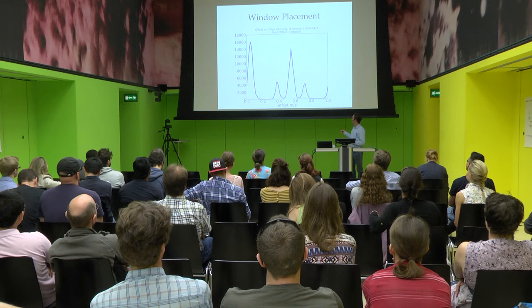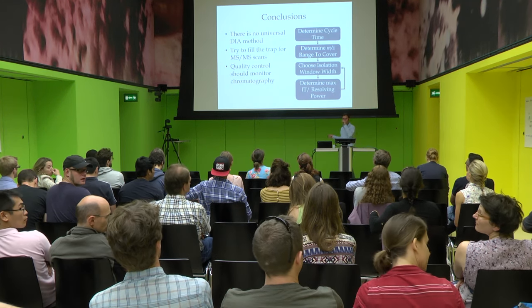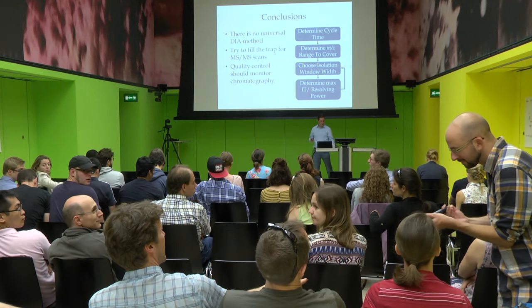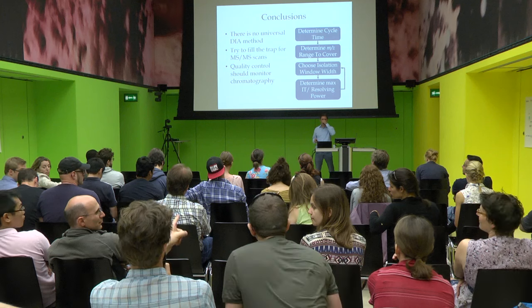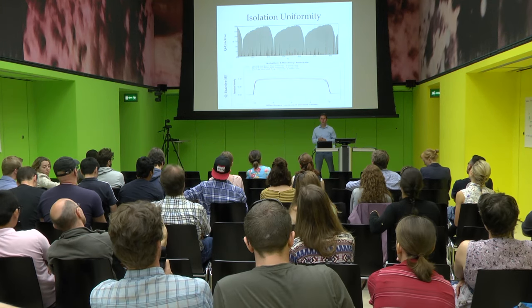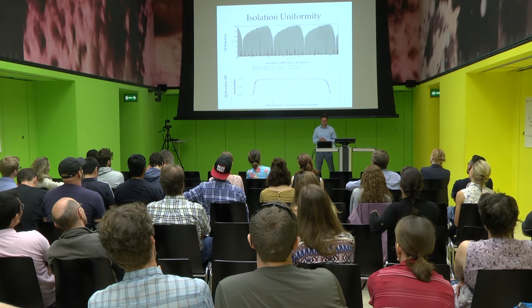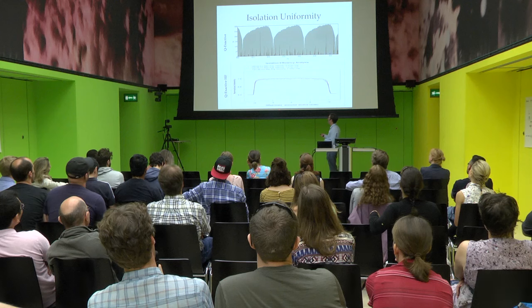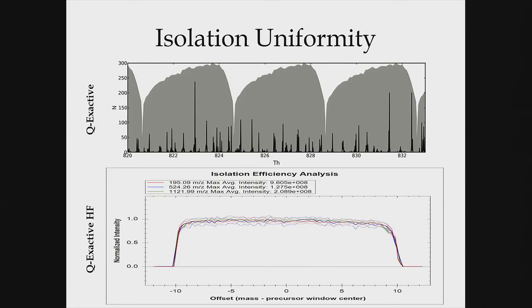So yeah, I'll just skip this one. That slide. So there is some signal drop off. What's the width of that signal drop off there? Oh, what's the width of the drop off here in the edge? Yeah. So it's about a half mass to charge.